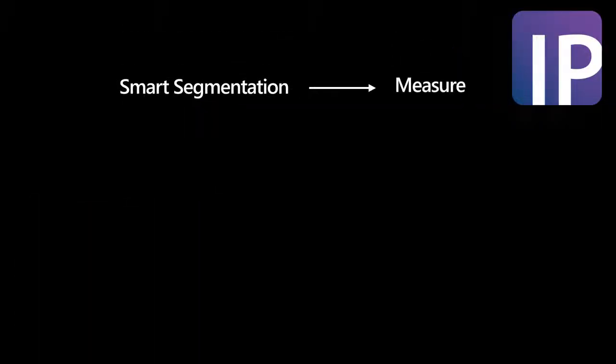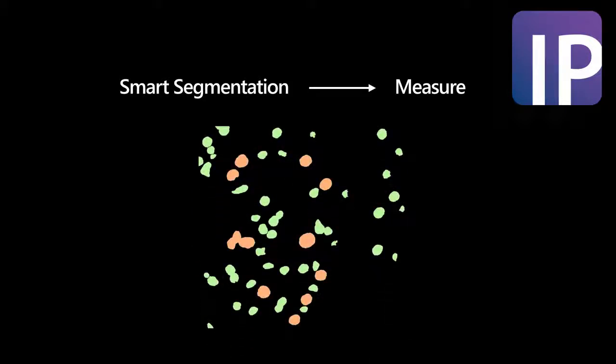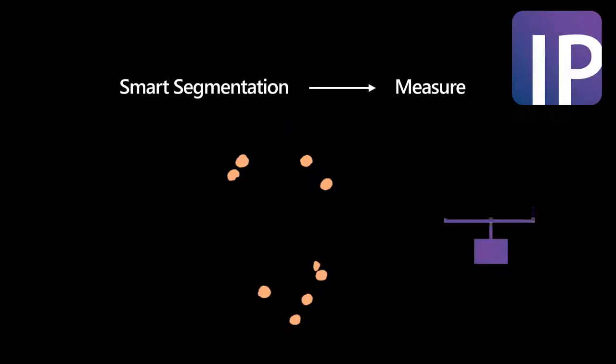Once isolating structures, the next stage of our process is to identify one or more measurements that will best fit your application data requirements. Measurements have been organized by the types and classified into categories. This vastly simplifies the measurement parameter selection and reduces the complexity that can occur with other packages.